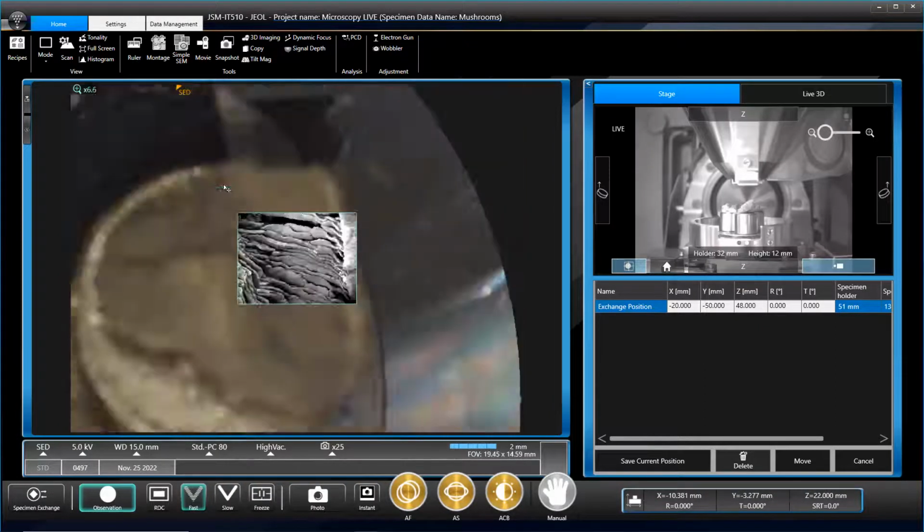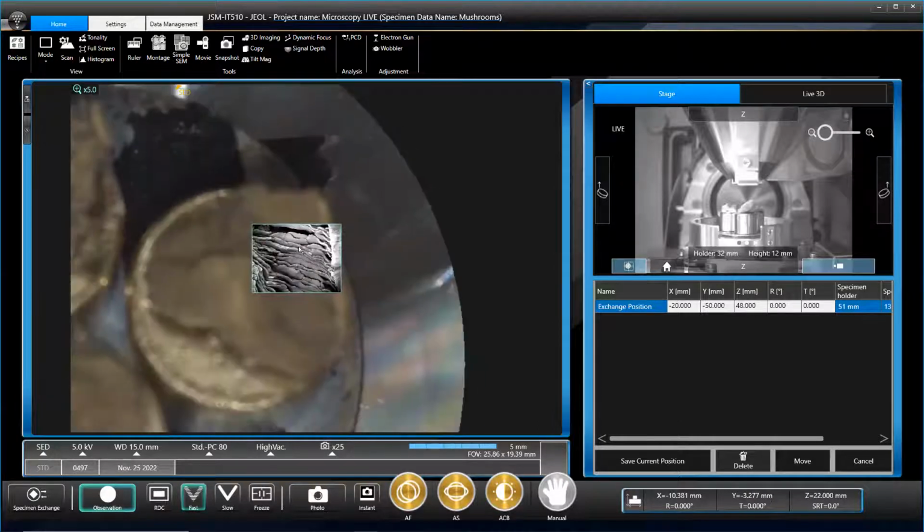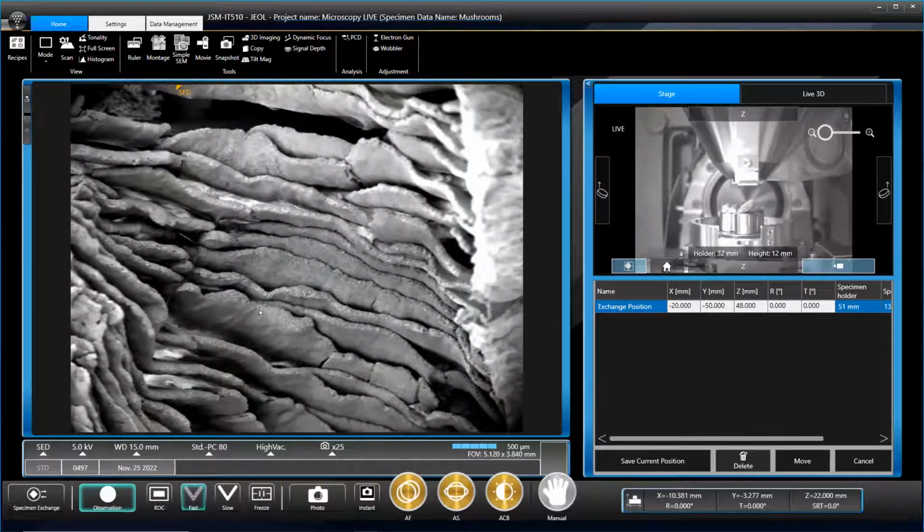So at the moment, we zoom all the way out. Here are 3 little mushrooms. We have a shiitake mushroom, which we're currently on. This is an oyster mushroom, and this is an eringi mushroom. So just going to drive around, see what's there. We've had a quick look, I will confess, just so we know it works, basically.